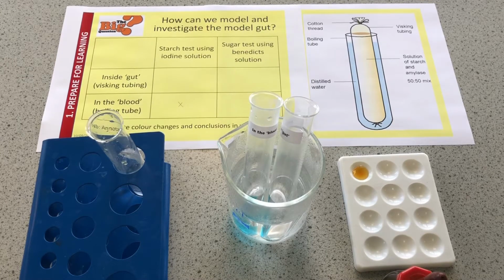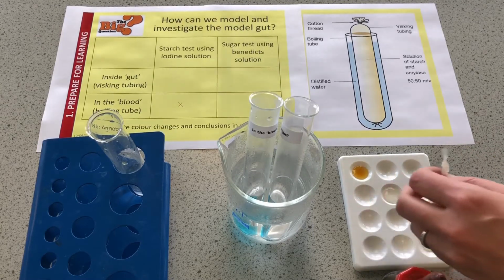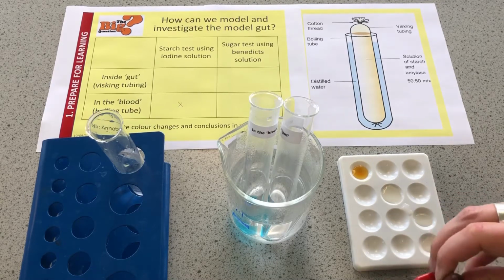So I'm just going to give that a snip and as carefully as I can try and drain some into there. So starch may be present if the mixture has not been left for long enough and some of it hasn't been broken down by the enzymes. Equally, if it has been left for long enough and the amylase has chopped up all the starch, we will have a negative result and it will stay orange. Let's see what we've got.